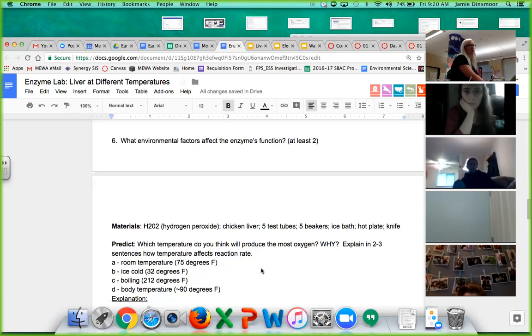So it will give us that relationship. So find a ruler so that we could do that. Huh. Where are all the rulers?